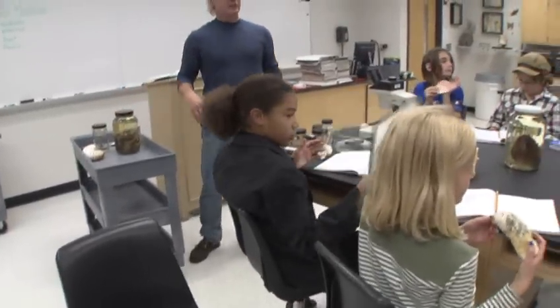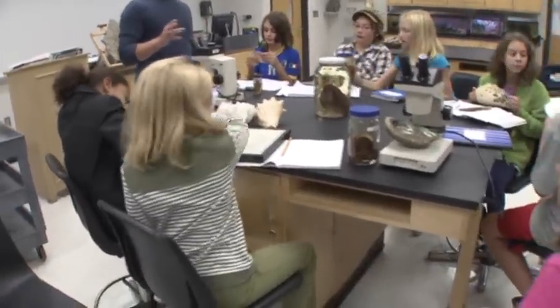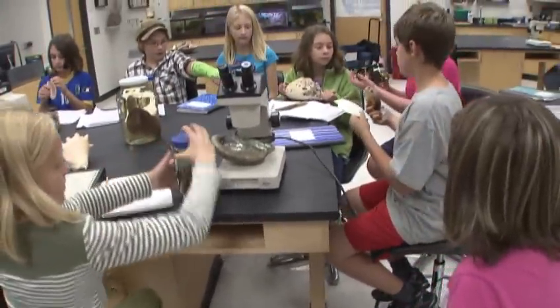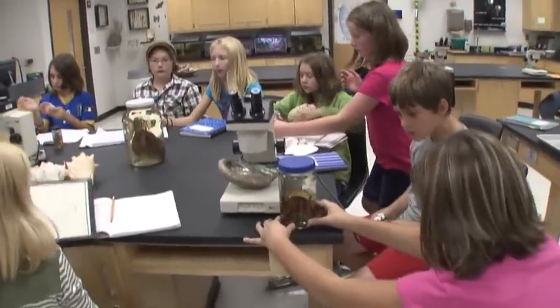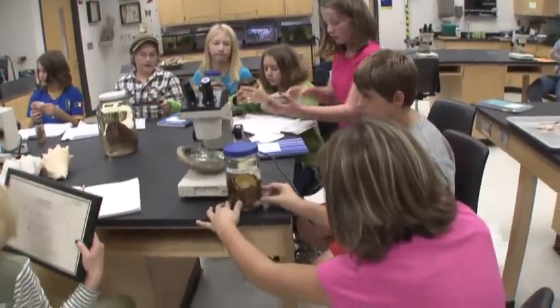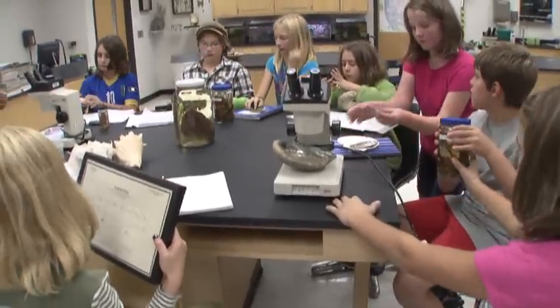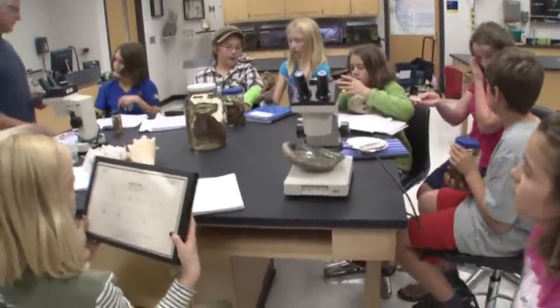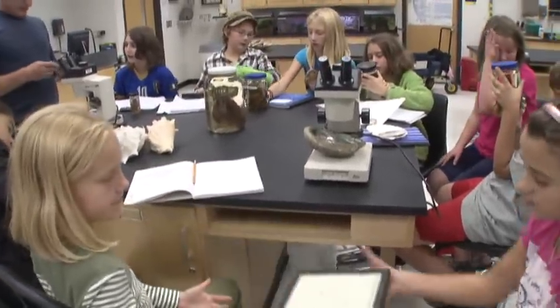Now, Courtney and I are going to dissect the clam here very soon, but we're also going to dissect the squid at the same time because I don't want to run out of time here. So what we're going to do is I'm going to go right to the squid and pass some squid around. First of all, I'll wait till you guys are done with those. Aren't those cool? A lot of diversity here, isn't there? Look, that's what that was.